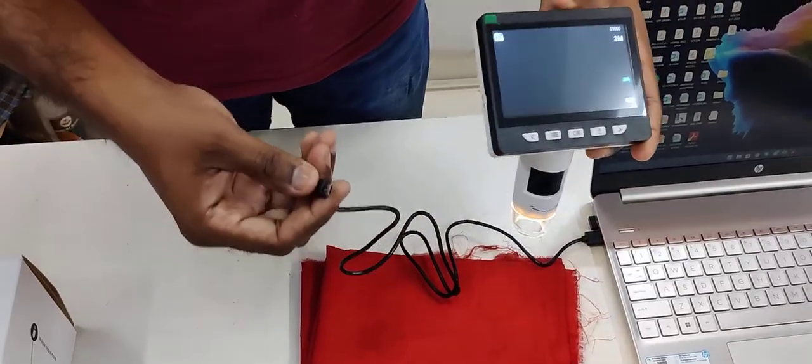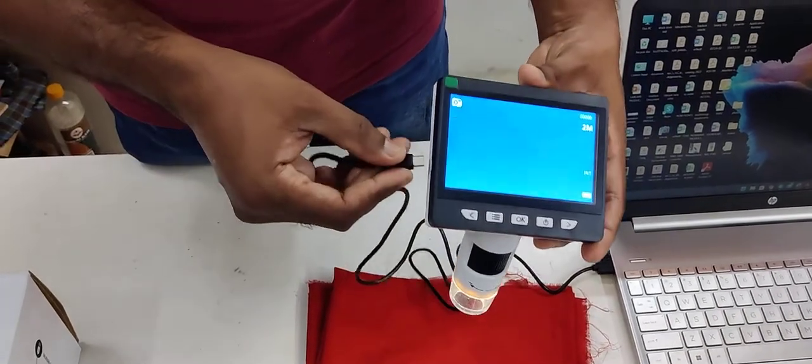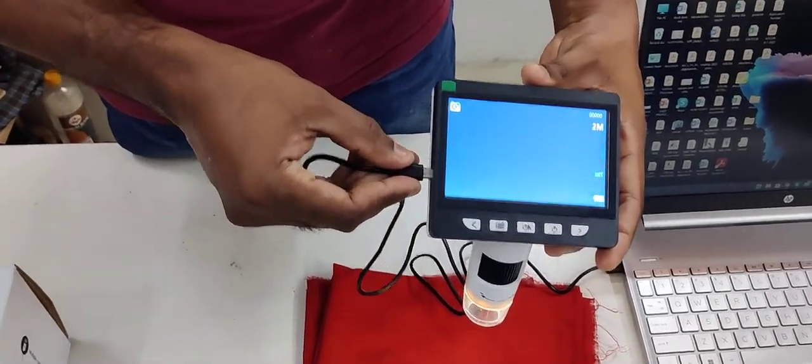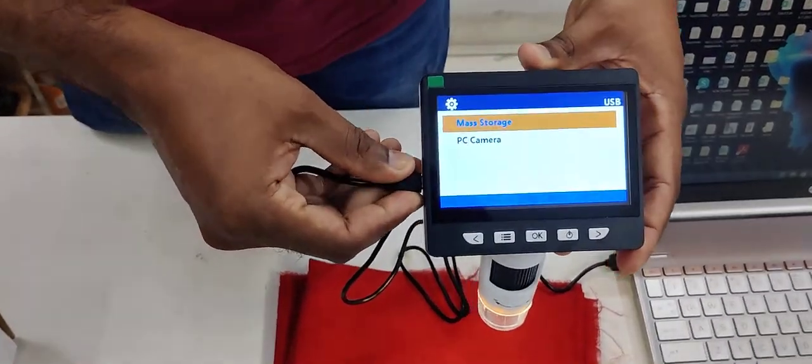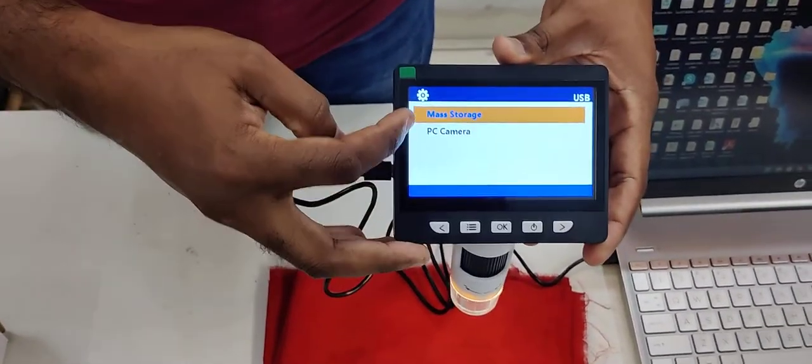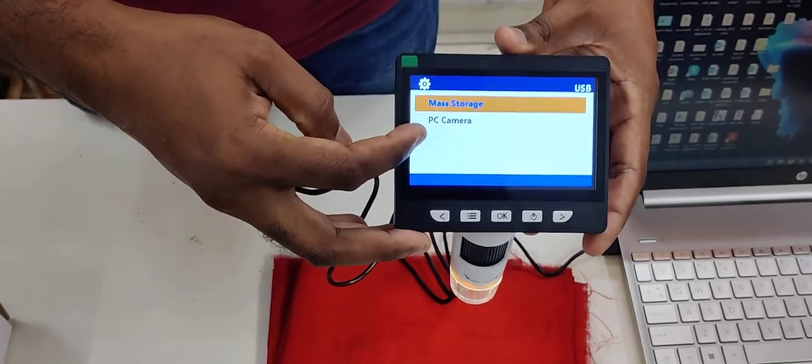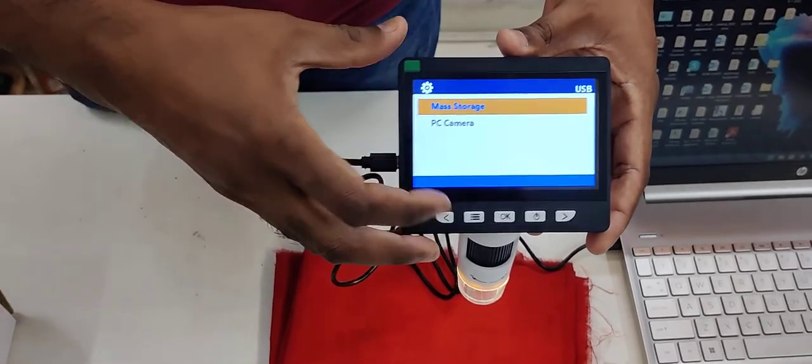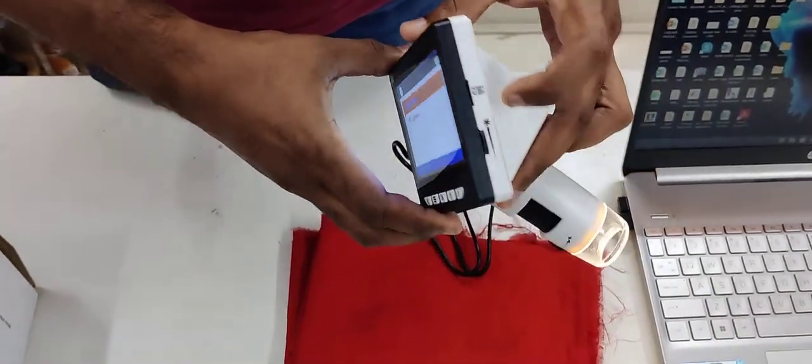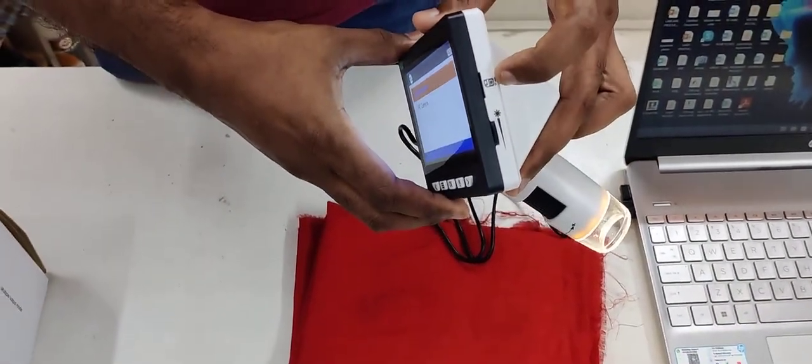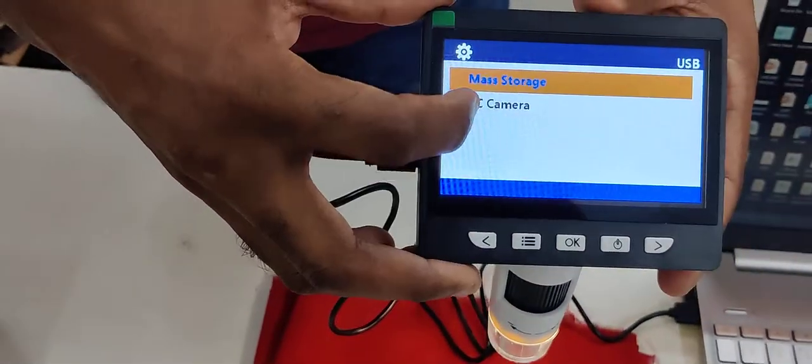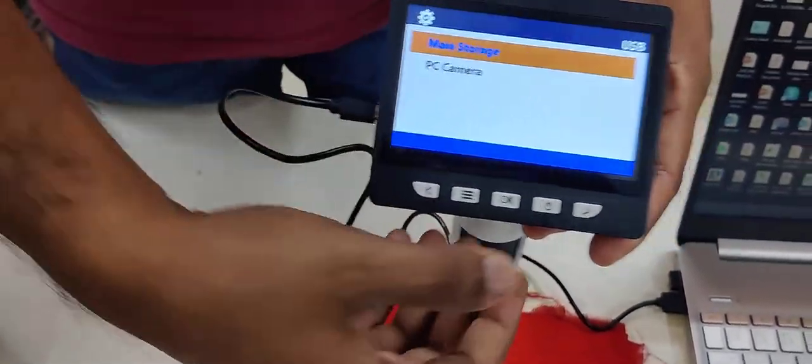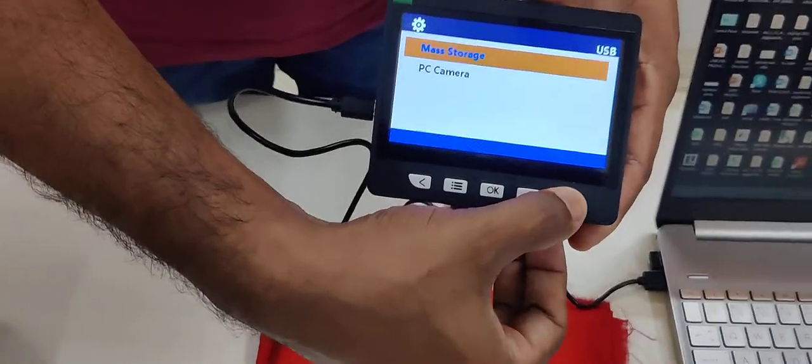Use this USB cable. When you connect, it will ask mass storage or PC camera. Mass storage means it's a SD card, and PC camera is a system.